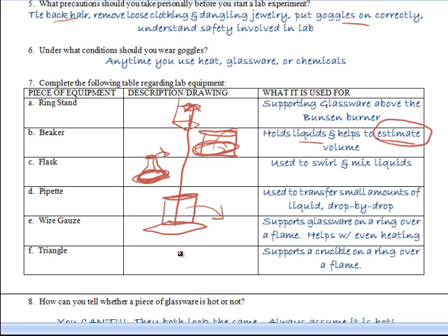And finally, a triangle. This is used to support a crucible on top of a ring. So again, you put it up here, and then you can put the little crucible inside, and then you can put the flame underneath, and really get the flame up and around the sides of the crucible.